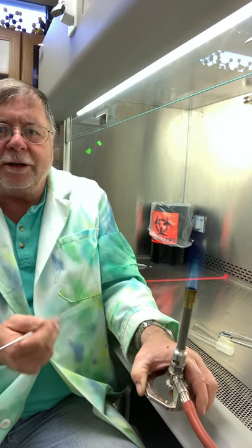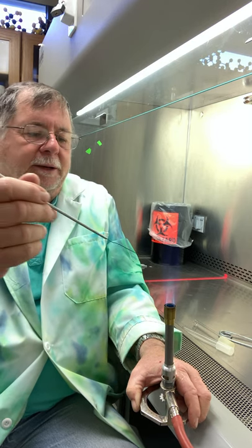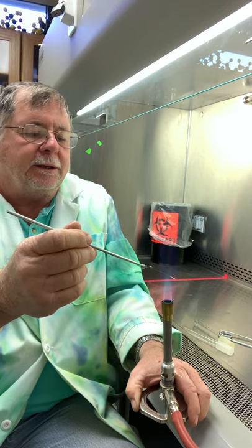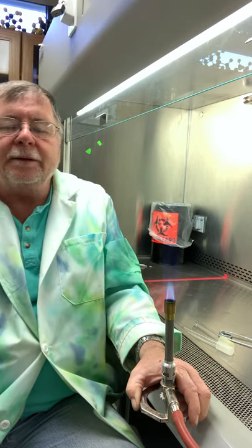But if you touch your lab coat by accident or the outside of a test tube, you have to start over. Okay, and that's no big deal. You just go like this and get it red hot, and then sequentially heat it till it's done.